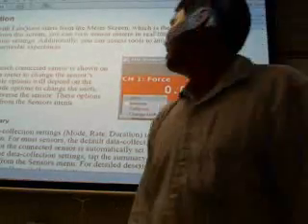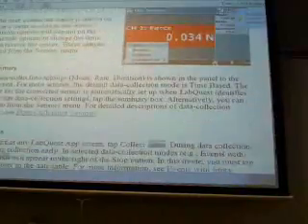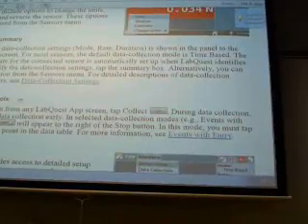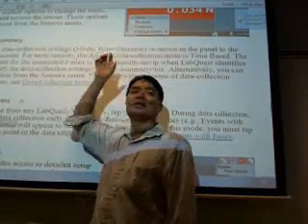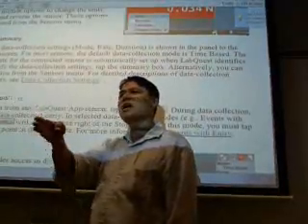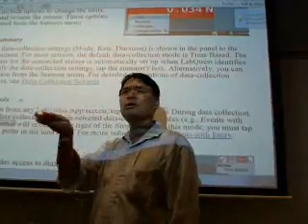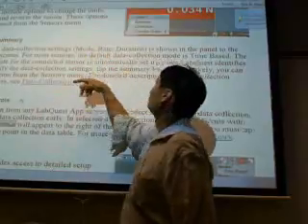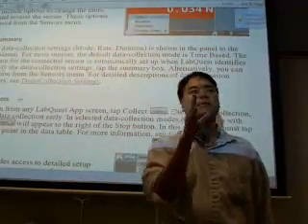All right, so let's go down here, and then we're going to take a look at the data collection summary. There are different modes of data collection, depending on the experiment. The mode we're going to be using is time, and we're going to have a regular interval, but they also have trigger mode, other types of modes. The rate. The rate is the frequency that you're sampling.